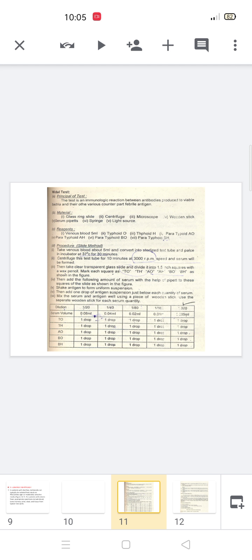Second, we observe the blackening in the bottom of the TSI media, which confirms that the microorganism is a salmonella, because this blackening of the media is due to the production of H2S gas. And we have discussed with you the H2S gas is produced only by the salmonella species in the Enterobacteriaceae family, and this is due to the biochemical activities, that this microorganism uses some amino acids, sulfur containing amino acids. So the blackening occurs here.